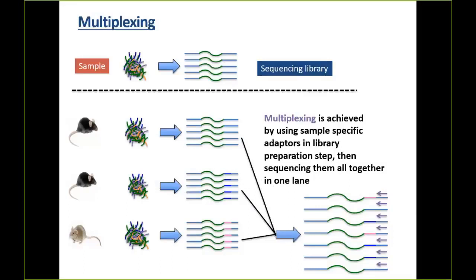Typically on an actual adapter, it's going to be a difference of usually a base barcode. So it's usually going to be an 8 base sequence, although it might be more. But it's 8 bases, and every barcode is at least 2 bases different from every other barcode. So even if you have a single base difference in the barcode, you can still positively attribute it to its origin.